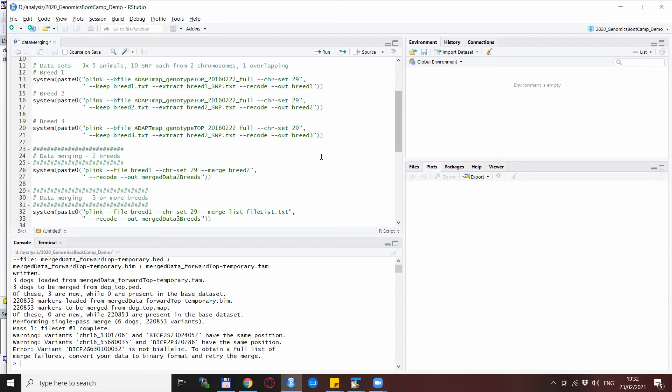So I will cut it here. I hope you learned something about the merging of datasets in Plink. You see it's fairly straightforward. Anyway if you would have any questions or comments or if you have your own experiences about the merging in Plink or in other software, I'm happy to discuss these in the comments below.